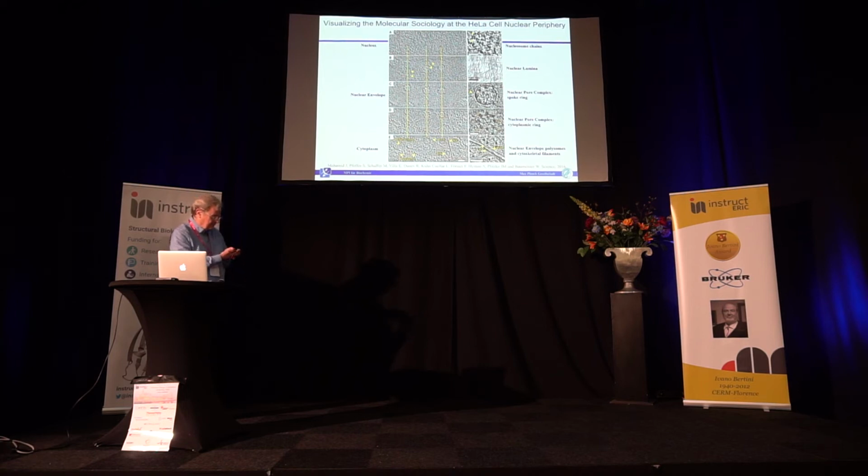Here you see we are in the region of heterochromatin. You see individual nucleosomes very easily. You can average them. I mean, they are 200 kilodaltons, so they are relatively small for subtomogram averaging. But you can get decent averages to a resolution of something like 15 angstroms of individual nucleosomes. But the problem is that what is really interesting is the connectivity, I mean the path of the DNA, and segmentation for that still doesn't work well enough.